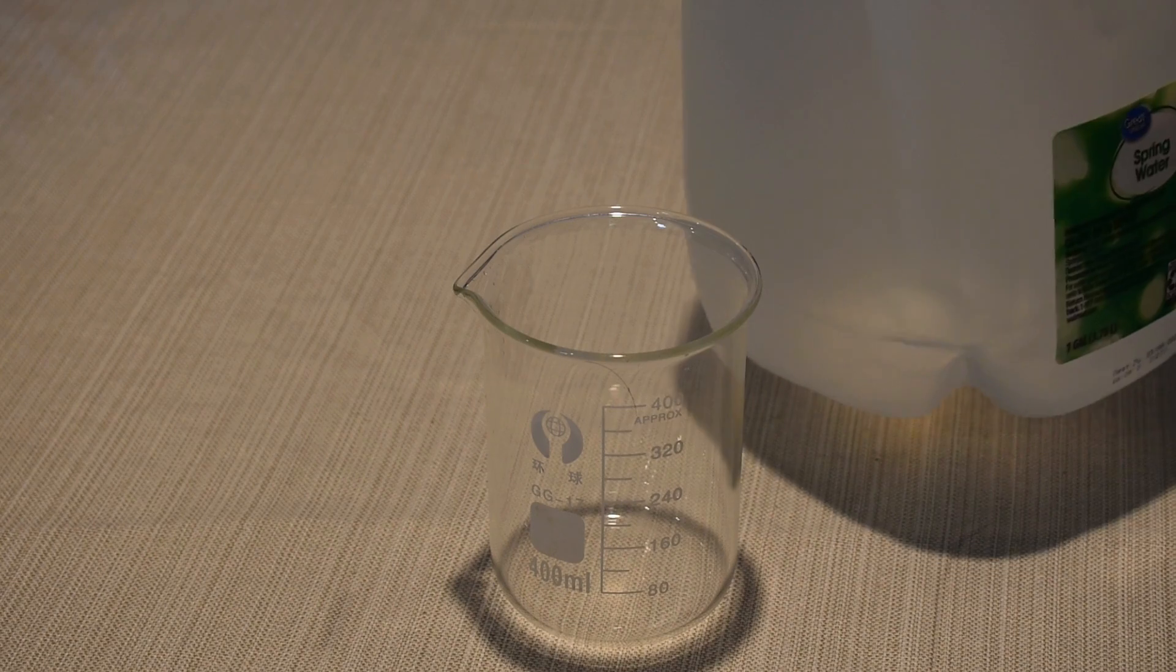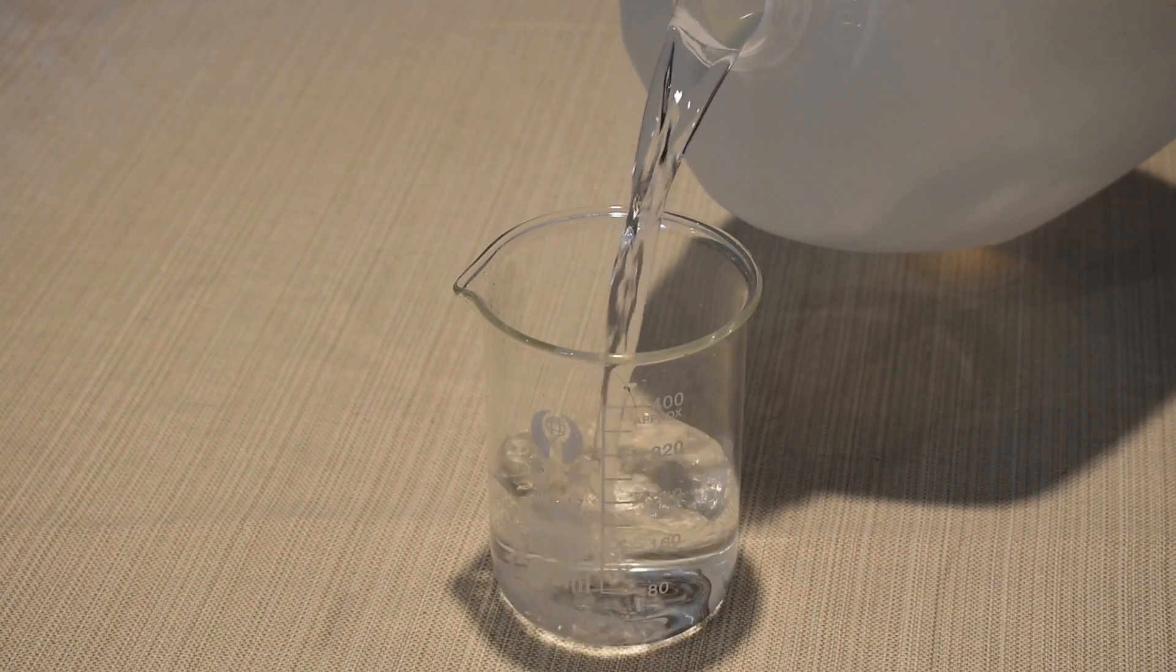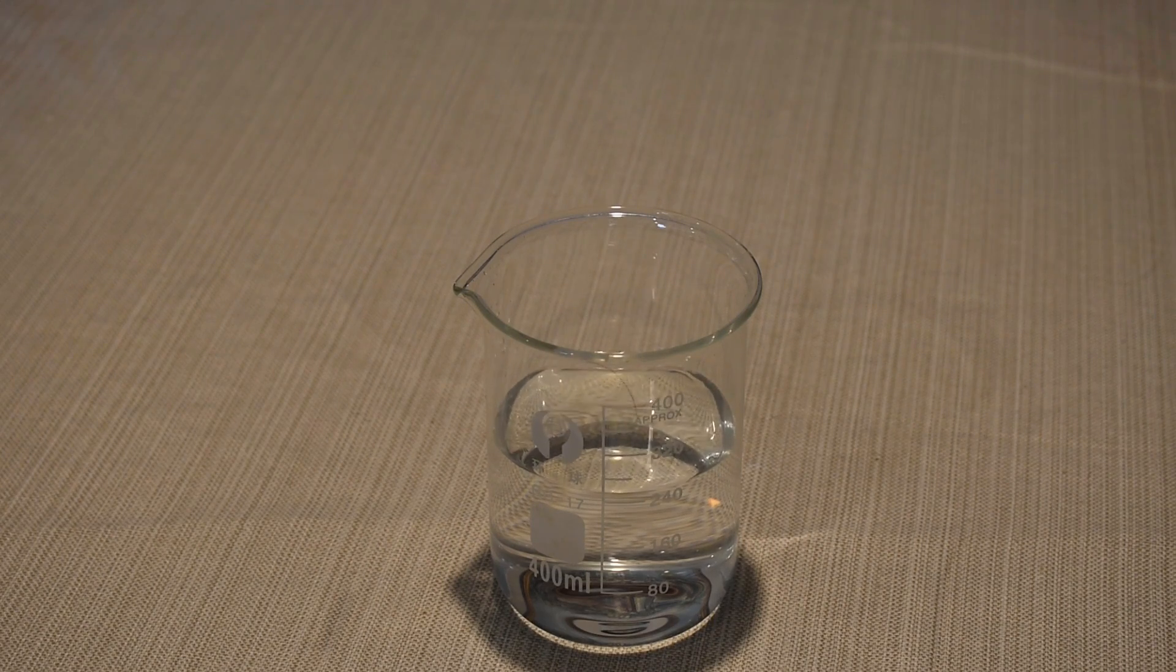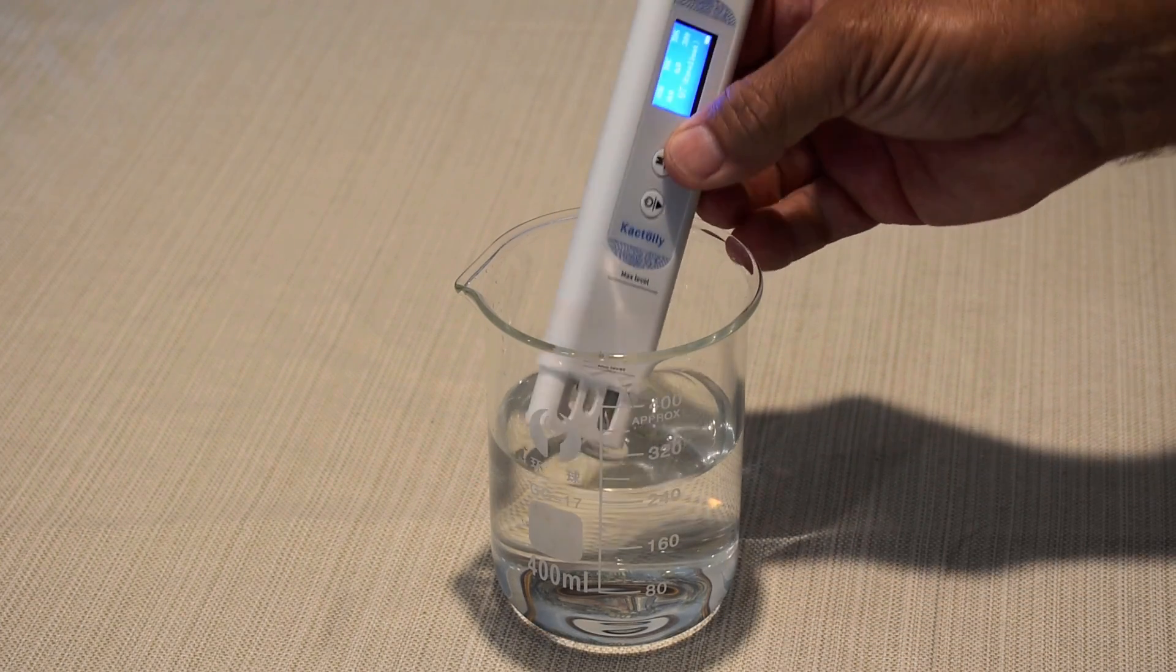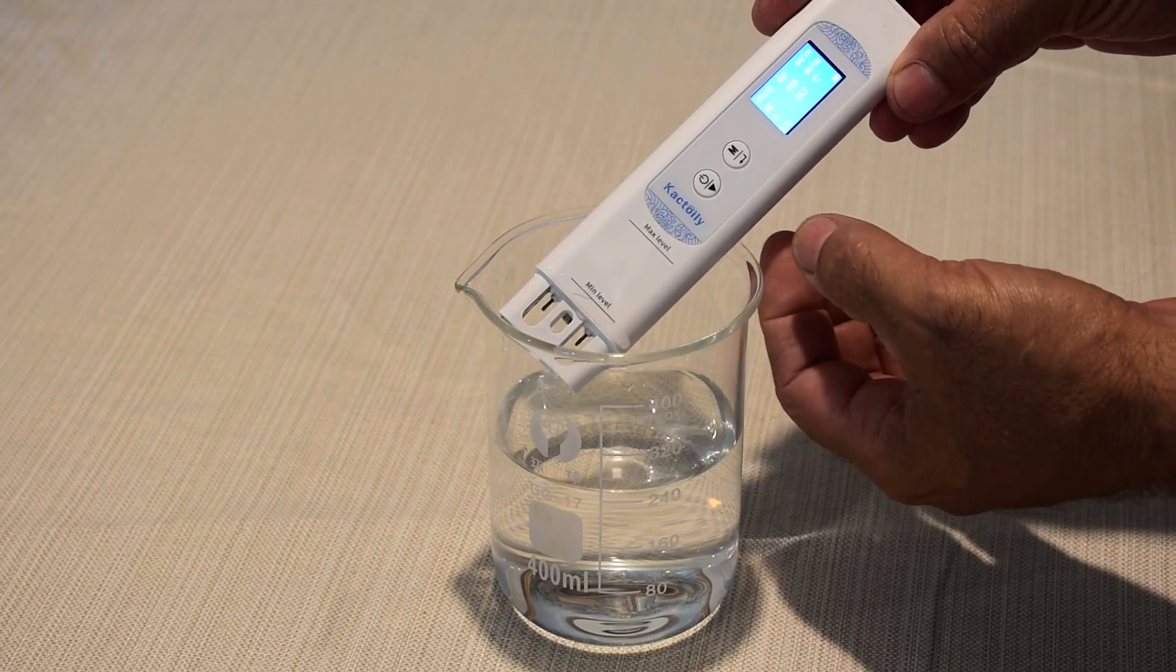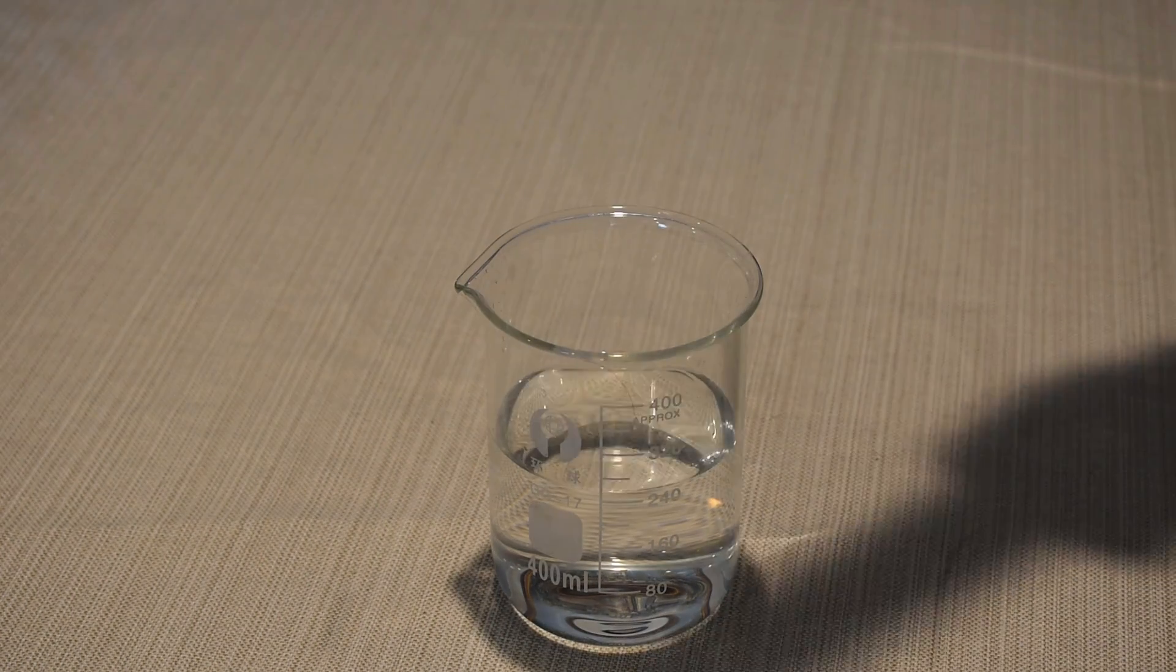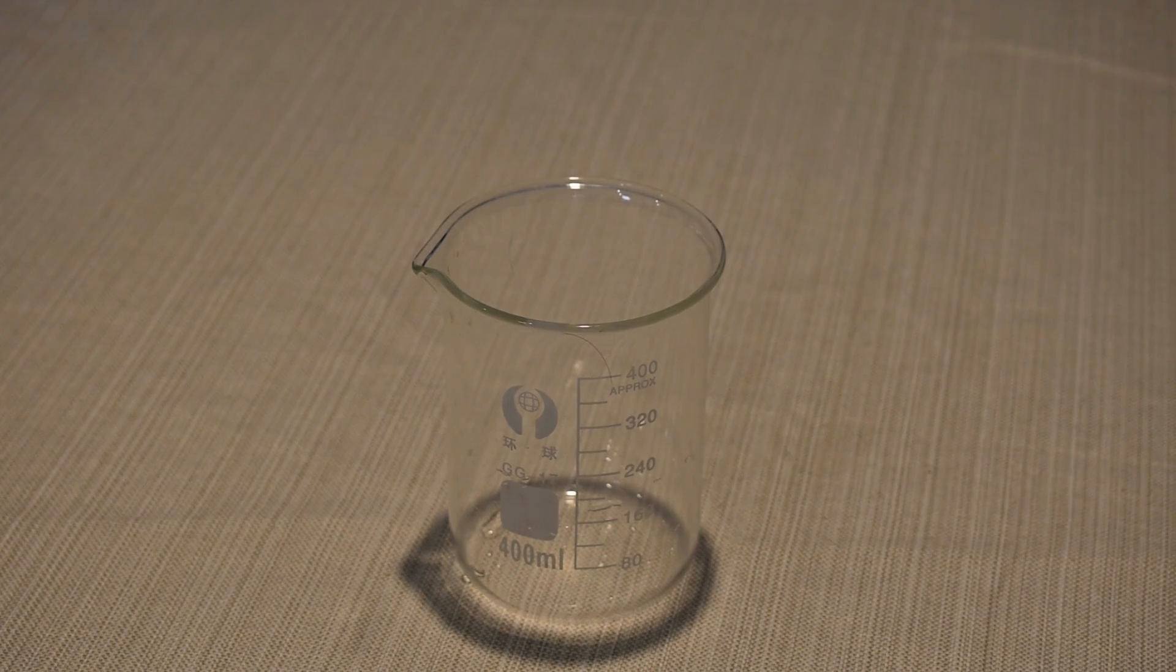Now Walmart spring water, very inexpensive, so it will be very interesting to see how this compares to the other brands. 97. COD 0, TOC 0, TDS 209, UV-275 0, EC 418.